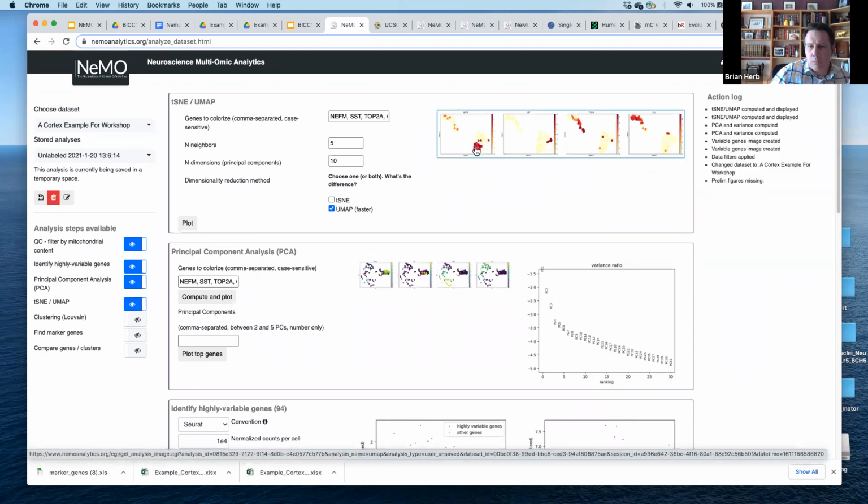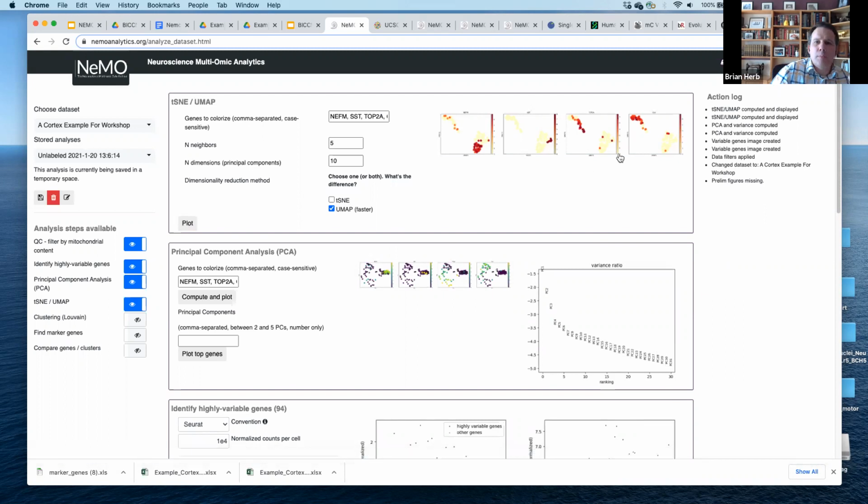This is, again, our neuron cluster down here. This is a little grouping of inhibitory neurons. And so, as you're working through this, use your biology mind of starting to tease out what these cell types are.